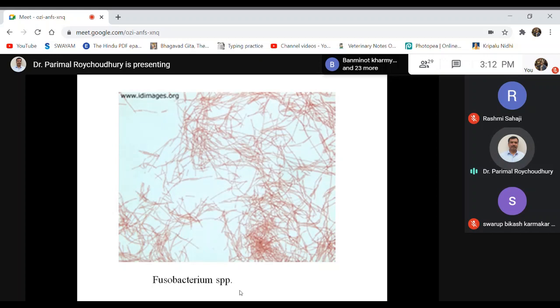But after that, we need to go for the staining reactions. We perform the regular differential staining, and some special staining, even the spore staining. Then we generate a lot of information about this organism, including motility; we study whether it is motile or non-motile. And then we can almost identify the genus of the organism up to that point.